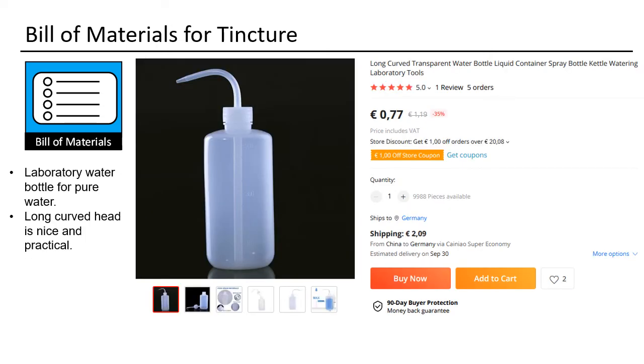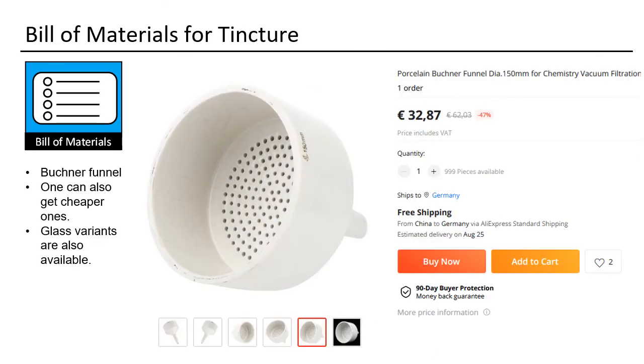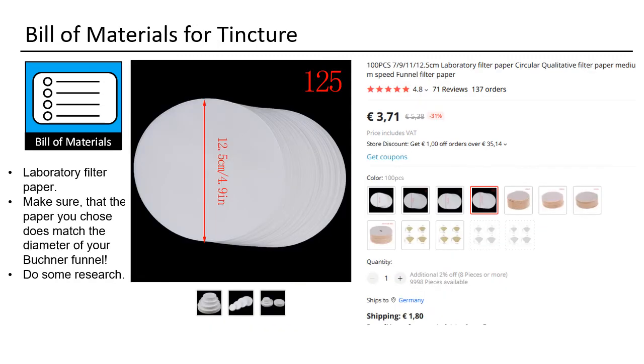Laboratory water bottle for pure water. Long curved head is nice and practical. Buchner funnel. Filter paper. Set from an old DDR pharmacy. Buchner funnel. One can also get cheaper ones. Glass variants are also available. Laboratory filter paper. Make sure that the paper you choose matches the diameter of your Buchner funnel.